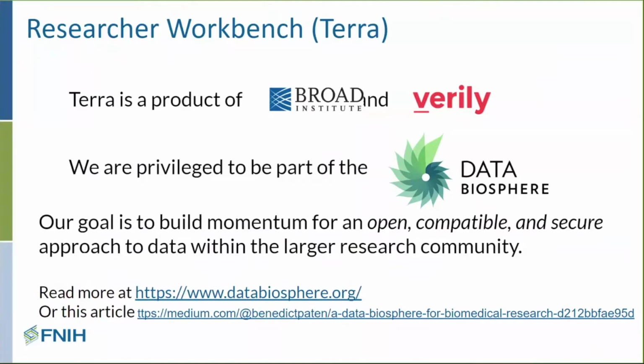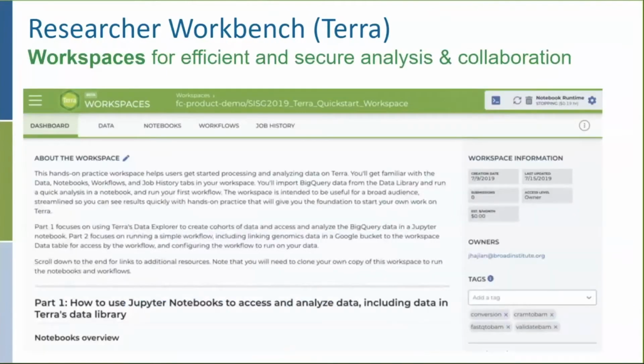So what does the platform actually look like? Can I have the next slide? Okay. This is a screenshot not of the landing page, but of a workspace in Terra. A workspace is the fundamental unit, a computational sandbox that keeps everything you need for a particular research project in one place.